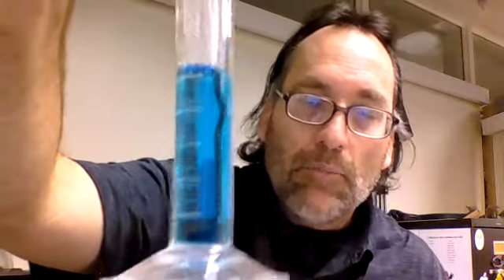The other thing I'm actually noticing, and I know this is hard to see on the computer, is the solution is getting a little bit lighter in color. So not only is there a small change to the paperclip, but there's also a change in the color of the copper sulfate solution.